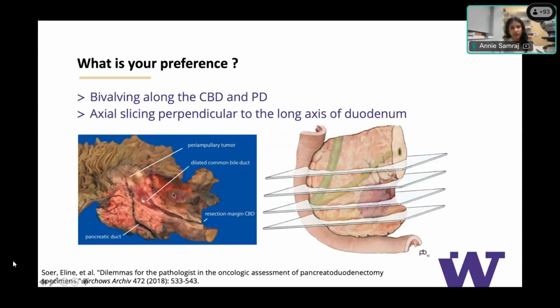So here, if you look at this picture, you can see the folds of the duodenum right there. Here you can see the tan yellow pancreas. And then here you see this large structure, which is opened up. That lumen is the bile duct lumen. Typically, it's the largest lumen. And then we also have the pancreatic duct right here, which is typically small. So you're seeing the pancreatic duct and the bile duct meet at the ampulla or into the major papilla. So when you look at it this way, it offers a different perspective on the anatomic structure.